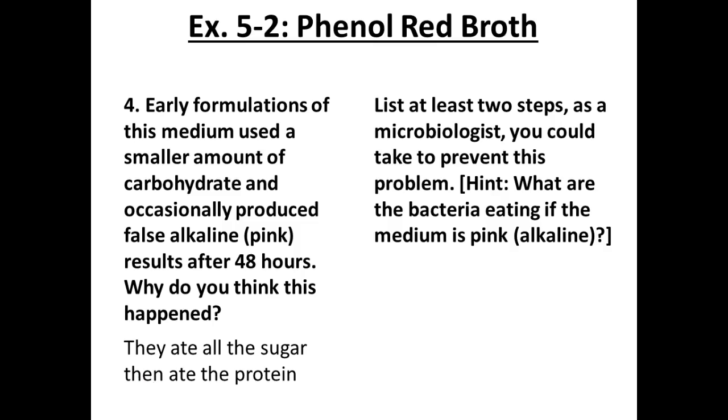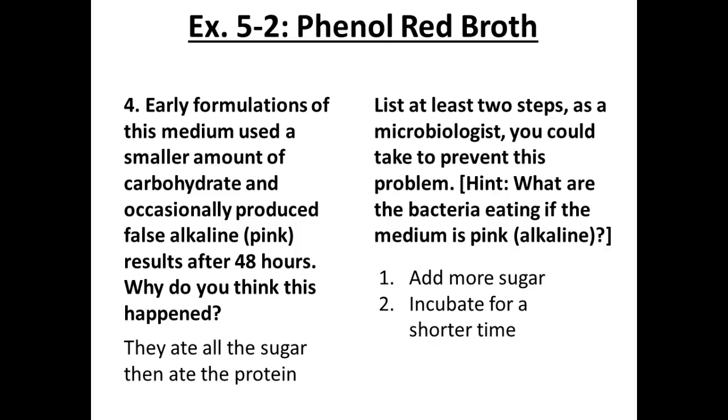In the incubator, shorter time, right? Catch them eating the sugar before they get to the protein. And again, what I had to do for some of your cultures, because you don't come in here 2 days after you inoculate them, is I put them in the refrigerator. Or in the case for some of you, I forgot, and so we had to do it again. So you could catch them eating that sugar before they moved on to the protein, so that you know it does have the ability to ferment that sugar.